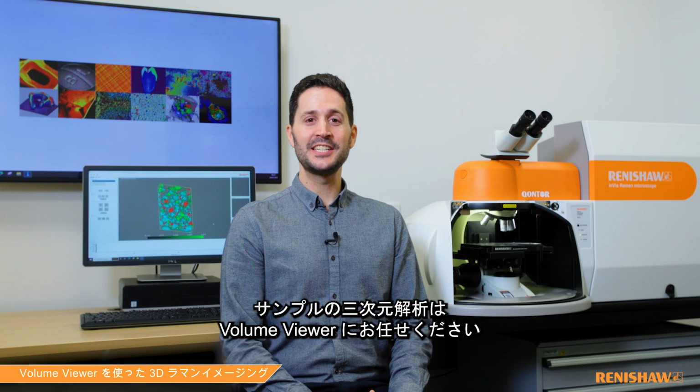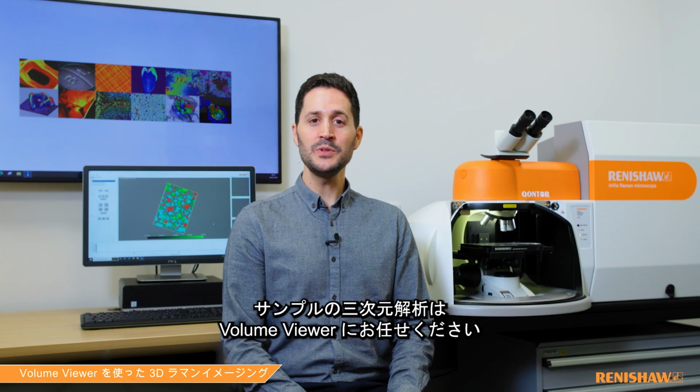The advanced functionalities of the volume viewer have everything you need to understand your samples in 3 dimensions.